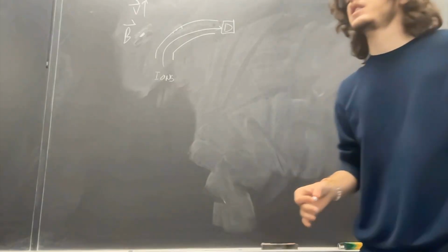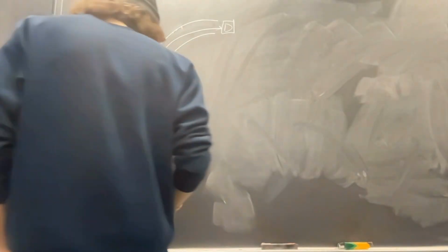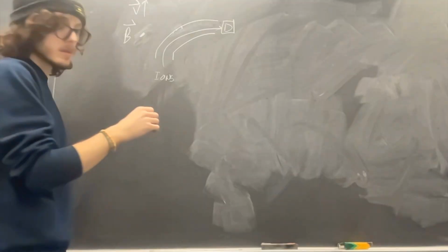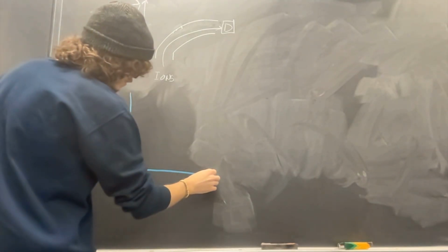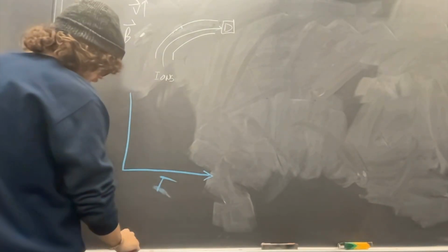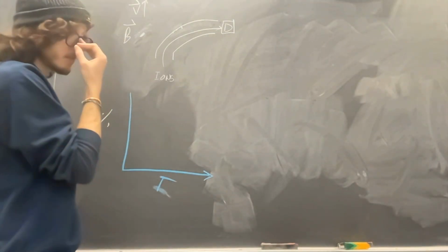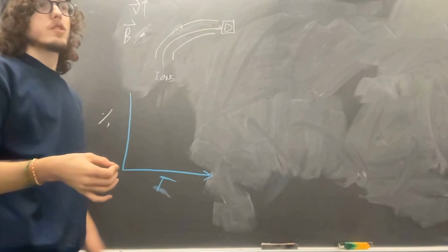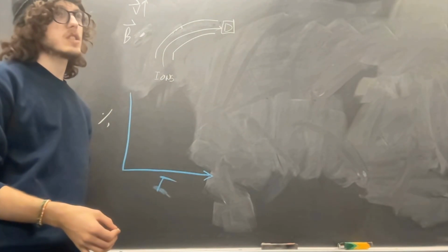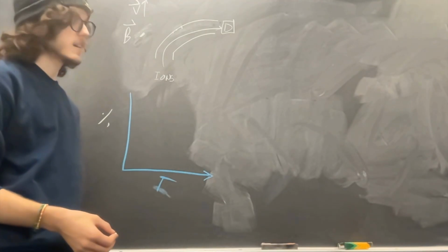What I want to talk about in this video is an issue with that. These mass analyzers are not taking into account Boltzmann's distribution. I'll bring up what that is again for those who have forgotten. If we plot temperature of molecules against the percent of the molecules, say we have a random mixture of molecules and we measure the average kinetic energy to be like 70 kilojoules.